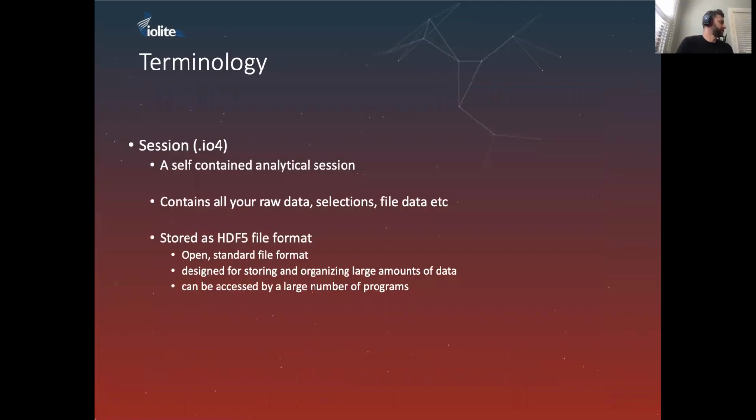And just to finish up the terminology, when we mention a session, we mean a self-contained analytical session. So normally from when you switch the mass spectrometer on until you switch the mass spectrometer off, everything that's done within that time we would call a session. So it can be multiple files, it could be as many samples as you like, but after you turn the mass spectrometer off, that would be the end of that session.